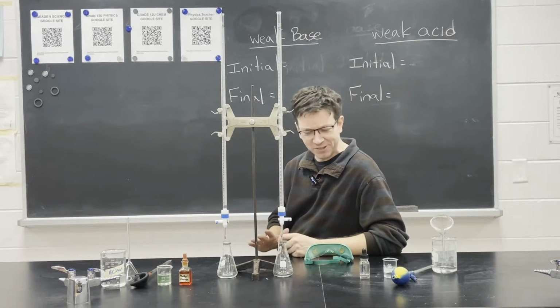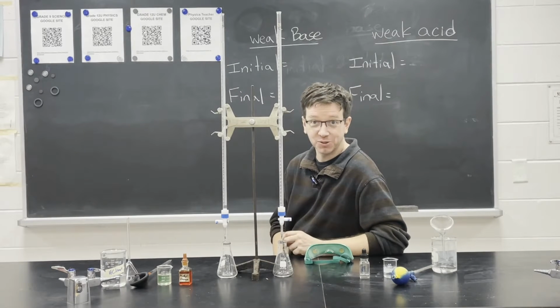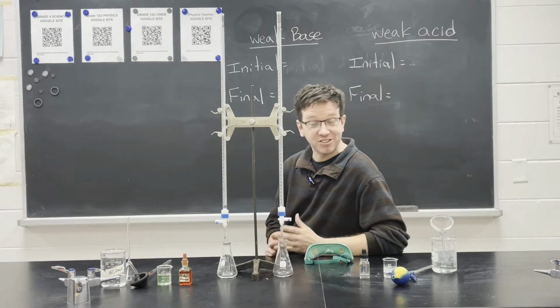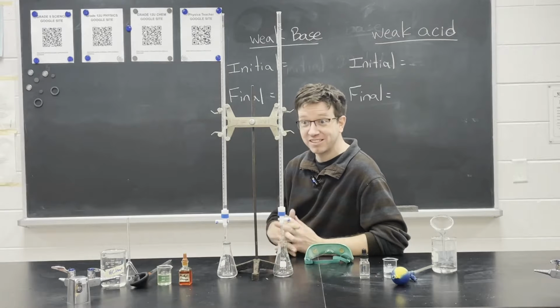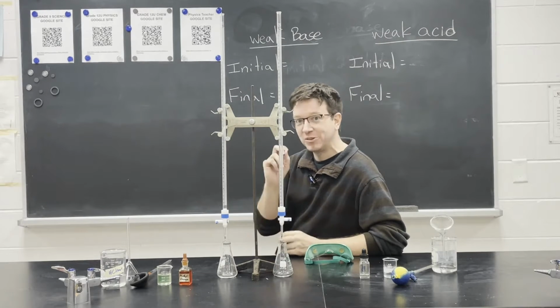Well, Chemistry Teacher today, because I'm going to be going over a titration lab that I do with my grade 12 chemistry students. Now, if you've never done a titration before, you can go check out the titration I do with my grade 11s, which is a strong acid with a strong base. But with my grade 12s, we're going to be doing two of them.